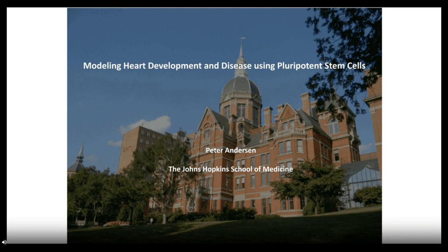My research is largely focused on early heart development and congenital heart defects, with a particular focus on congenital biology. In my lab, we combine genomic approaches with high-content imaging and flow-based technologies such as flow cytometry and FACS to study these multicellular events in complex tissue down to a single-cell resolution.